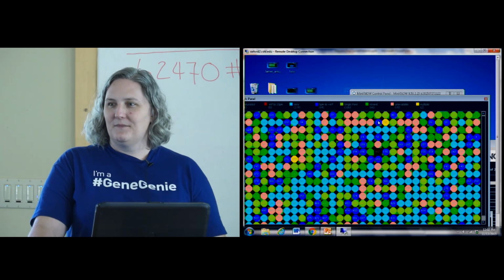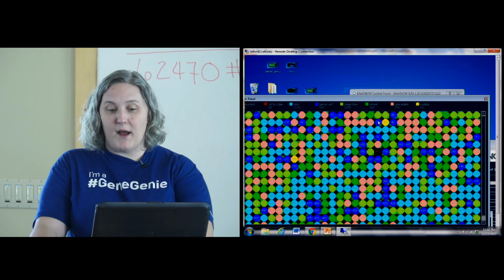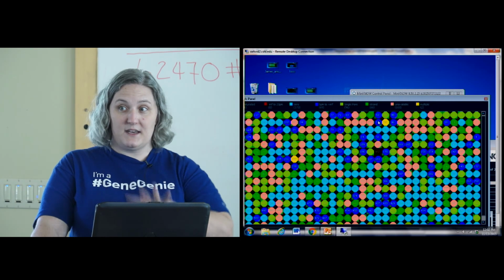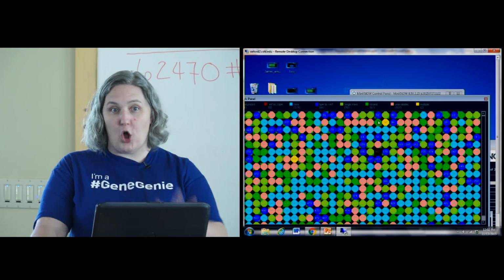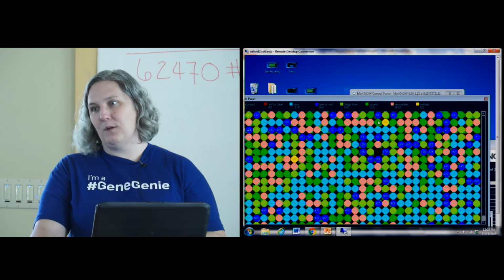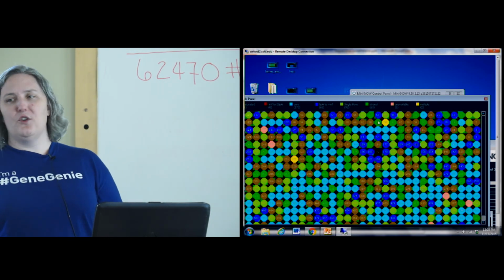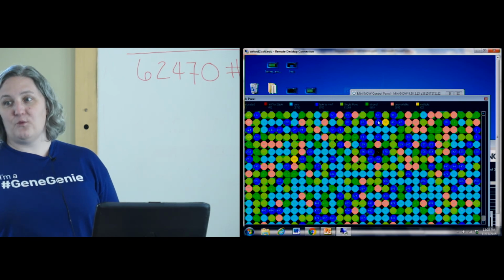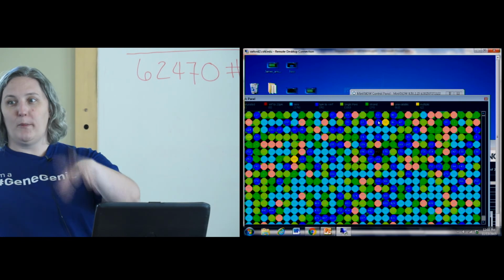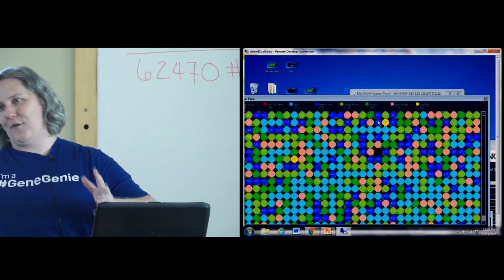So you have to do it manually? Right now, yes. There is a process where it unblocks as part of the script, so that does happen, but it doesn't do it for a very long period of time. If you want to do it longer than the script does, then you'll have to do it by hand. I have found that some pores, nothing you can do gets them unblocked. That's just the way it is. If you go back and look at some of these artifact reads, you'll see a normal read, normal read, normal read, then 10,000 bases that are like a 5-mer repeat over and over and over again.